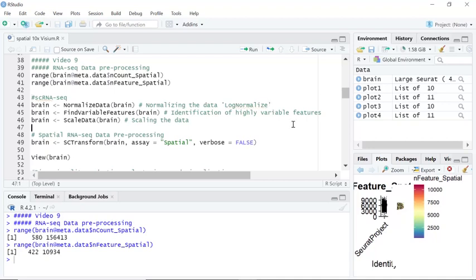Because of the technical effect and tissue variations, the log normalization method is not an effective method for spatial sequencing data normalization.